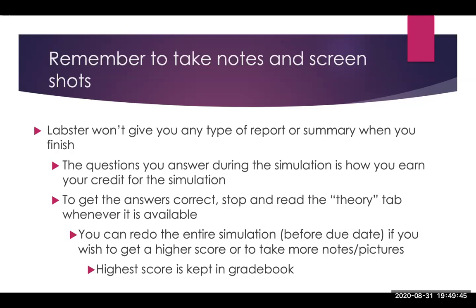Okay, Labster, as I mentioned already, is not going to give you any report or summary when you're finished. So it's crucial that you take notes and screenshots as you complete it, and this is why it took 3 hours. It probably would have only taken 2 hours, but I was taking notes and screenshots. And I mentioned also the questions that it's going to ask you during the simulation. You need to use that theory tab if you want to get them correct. And that's how you earn your credit.